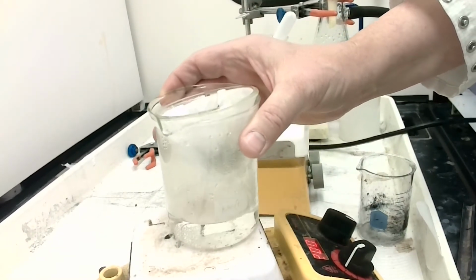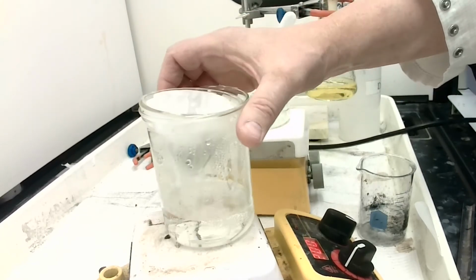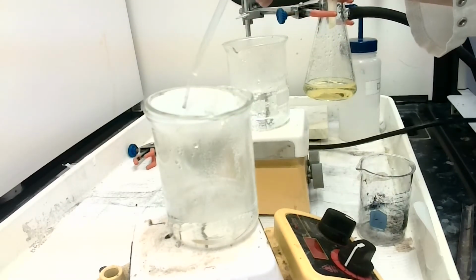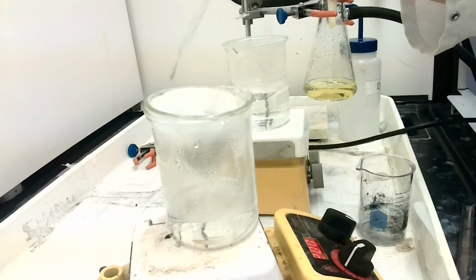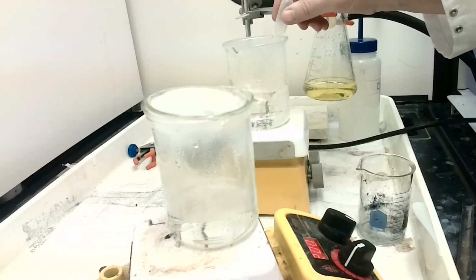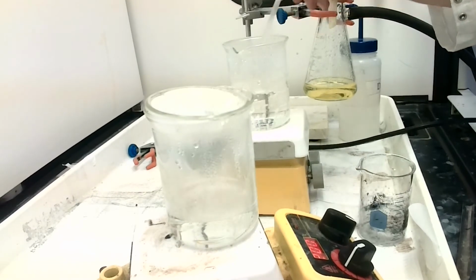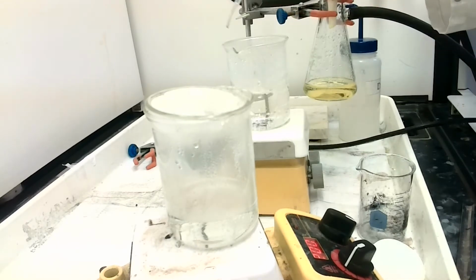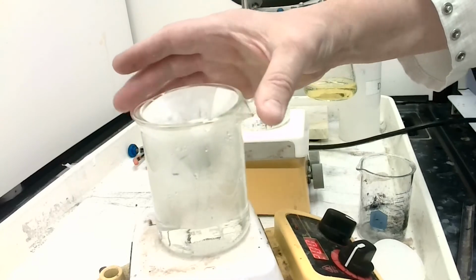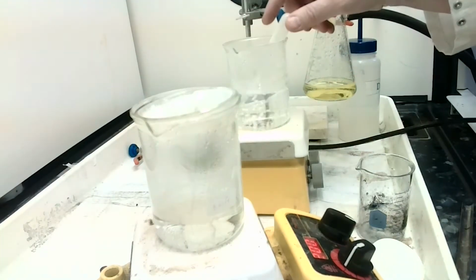And so what you try to do at this stage, and I'm going to keep spinning it around so I can see the other sides, is remove, the best you can, any crystals that you think may be stuck on the paper because the paper became too cold all of a sudden. And then we'll decide at the end of the lab if we did a good job filtering at this stage or not.